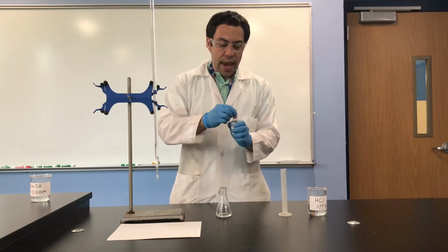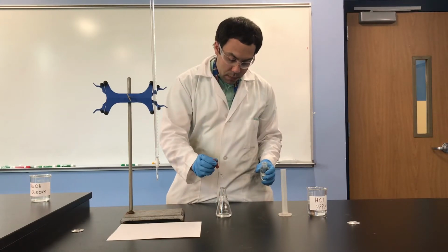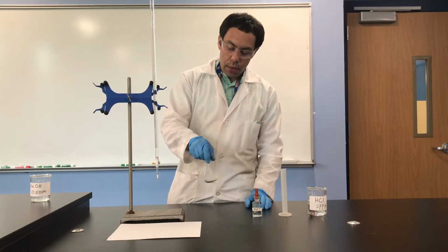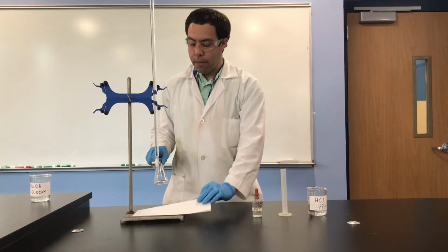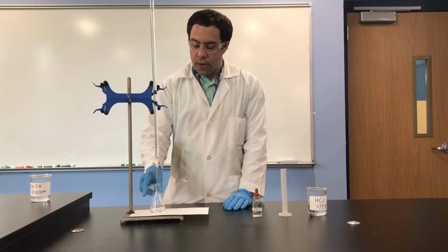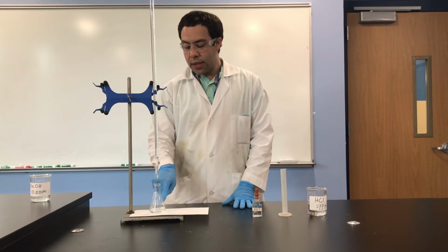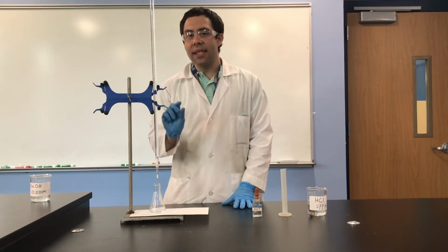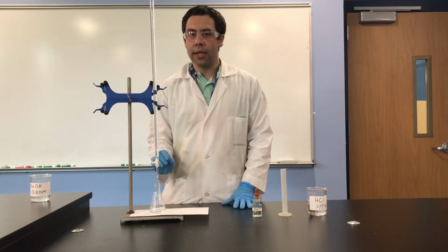I'm also going to take 2 drops of the phenolphthalein and place it into the acid inside the flask. I have this white piece of paper so that I can see the color change of the phenolphthalein when it turns pink. When the phenolphthalein turns pink inside of the flask and it stays a faint pink for a couple seconds, I know that the acid has been neutralized.